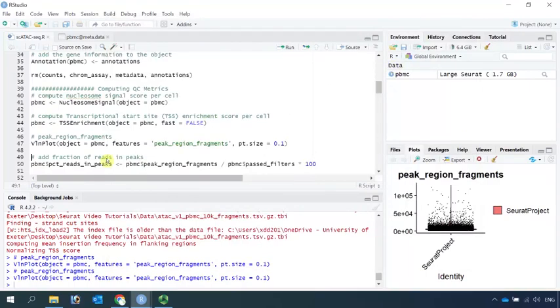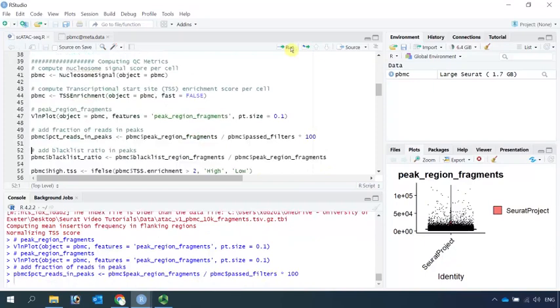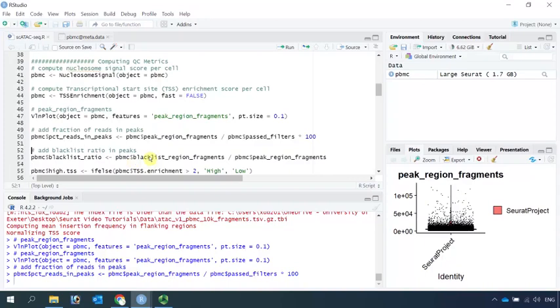The fourth metrics data that we use to perform quality control is the fraction of fragments in peaks. We can obtain this metrics data by dividing peak region fragments with pass filters. Let's run this function. The last metrics data is the ratio reads in genomic blacklist region. The blacklist region for the human genome was included in the Signac package.